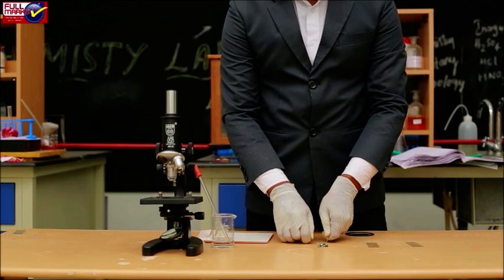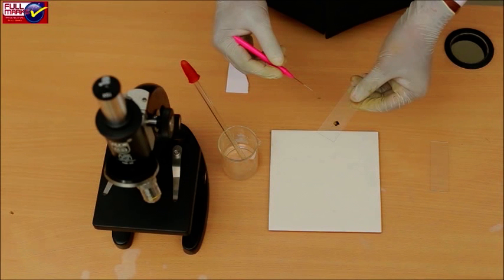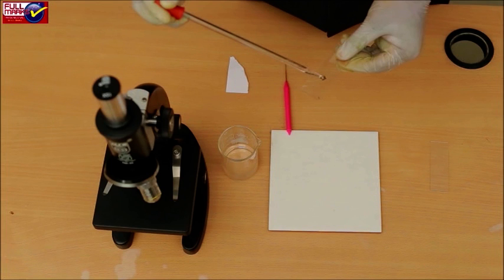Separate the anthers and discard the other parts of the bud. Put one or two drops of acetocarmine stain and squash the anthers. Leave the material in the stain for five minutes.